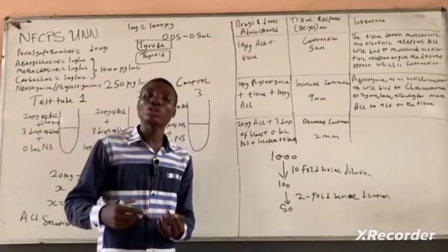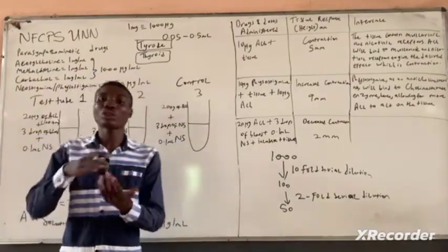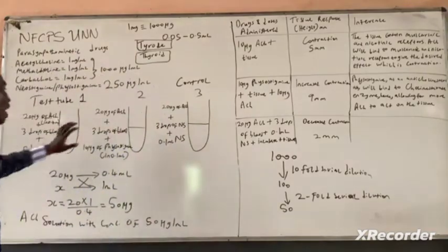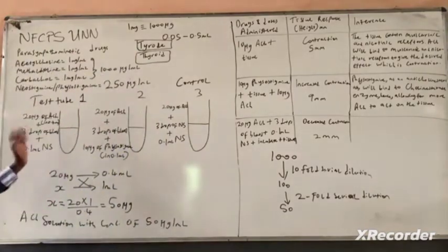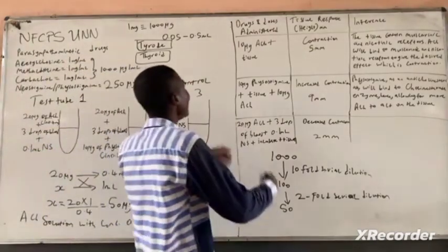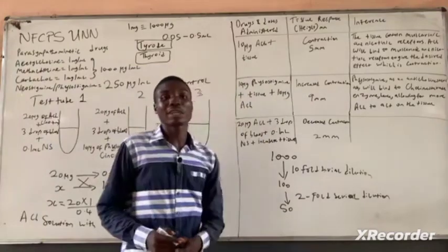I already explained why you need to incubate it, because the enzymes function at the temperature of your body, which is around 37 degrees Celsius. And then you pour it into the tissue. You are going to be getting responses according to the theories I just explained for you. So now let's go quickly into the report of this particular experiment.